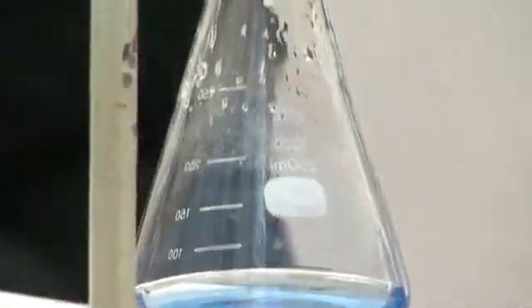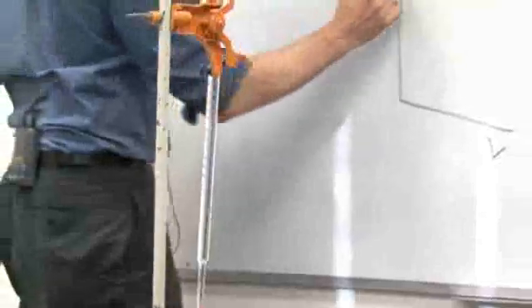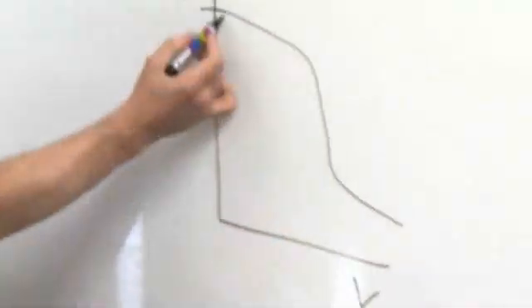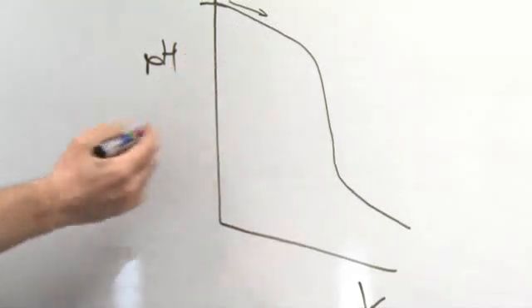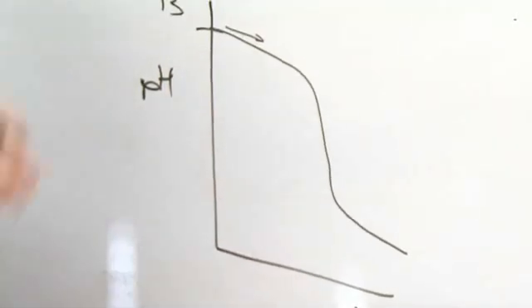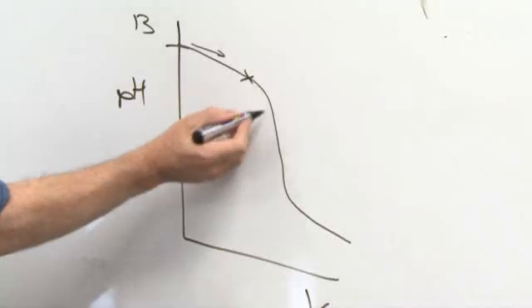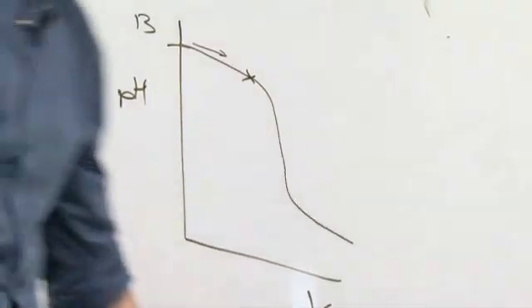Just remember your graph. Volume, pH. We started off with the base, so the pH was up here, roughly around 13. The pH does this. So we're moving along in this direction. When those yellow, when that yellow solution floats around for a while, it means you're getting close to the drop off. So you swirl. You just check the volume.